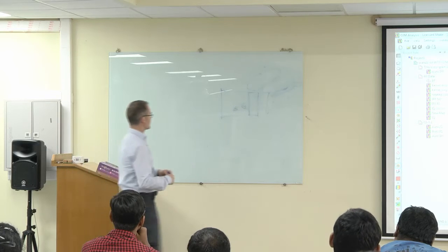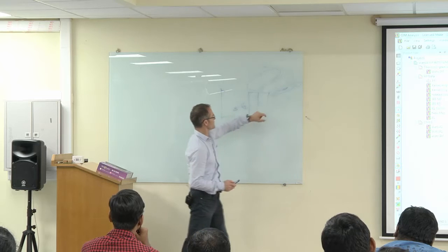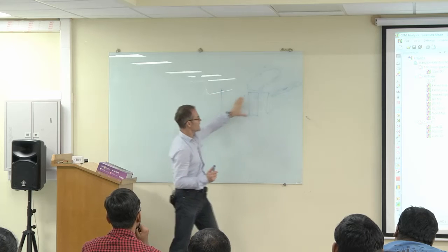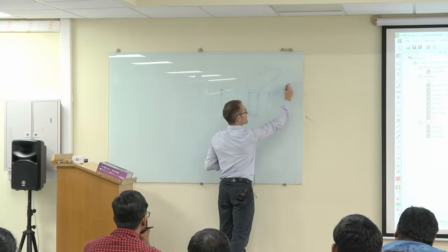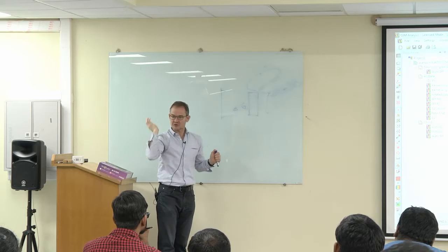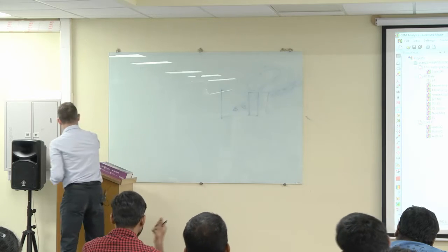No? So therefore, it is usually best to go to this or to this section here. This one when you want to measure textures, because you get the biggest amount of grains on a smallest surface. And this one if you want to see, for example, whether there are shear bands going through. No? That's best to see here. You can't see it on this surface here. So this is a consideration. But okay, now we have made a proper decision.